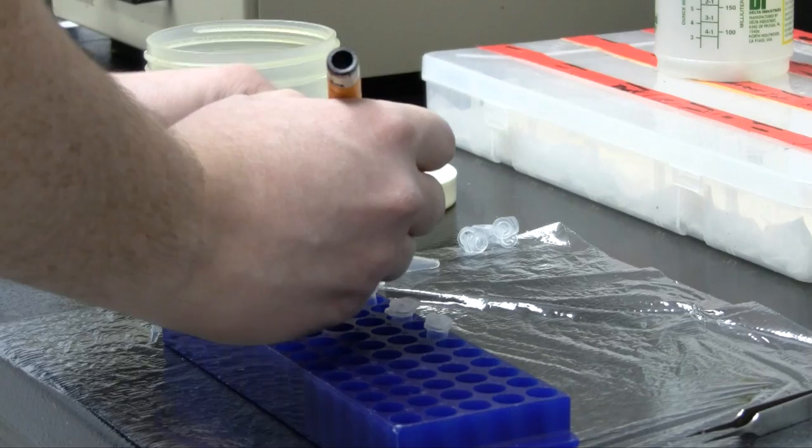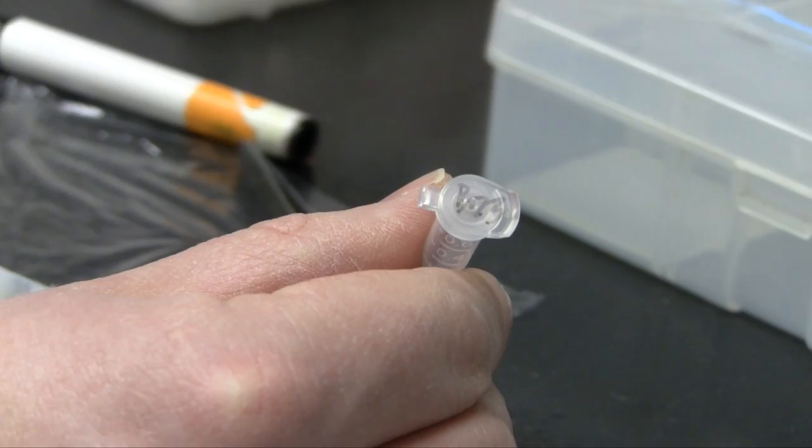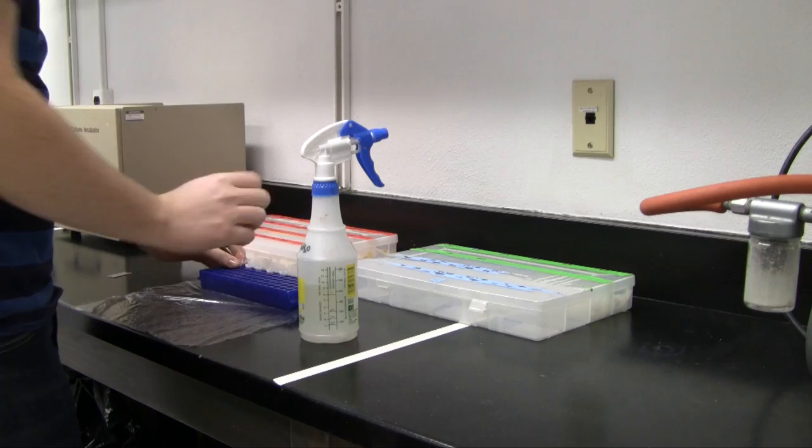To begin, 0.6 mL tubes are labeled and a hole punched in the top with forceps. Tubes are then sprayed with a fine mist of purified water in order to maintain high humidity during the nitrous oxide treatment.